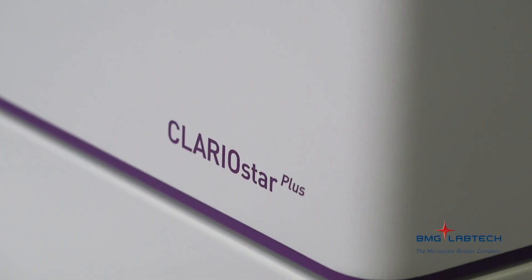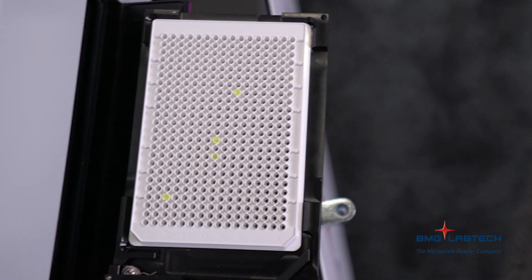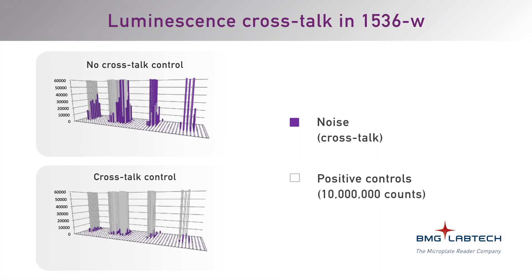Another thing — going back to performance — people know our FerroStar FSX instrument. It's our high throughput screening tool, our most sensitive instrument. People love the luminescence performance. We've actually taken some of that technology from that reader and brought it into the Claristar Plus. For luminescence assays now, the advanced crosstalk reduction tools are there. Basically, you get much better signal to noise. You eliminate crosstalk coming from the side of the plates as well as above. It's really going to improve anybody running a glow-type luminescence assay. The background is really low on the crosstalk — it's going to make a real difference to people.